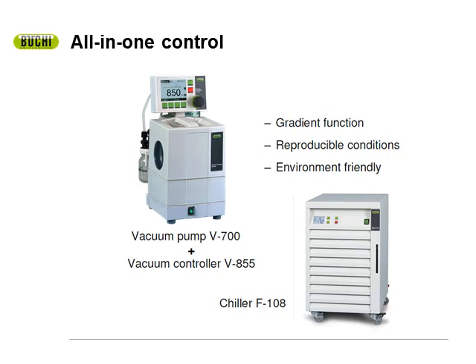Everybody that's worked with a recirculating chiller or had a recirculating chiller in their lab knows that these devices are left on overnight, and that consumes a lot of power. So it's another way we're trying to become more environmentally friendly.